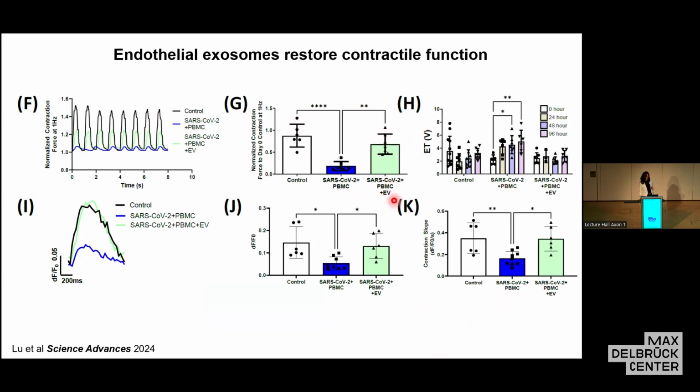And ultimately, this enables us to rescue this cardiac function, at least in the organ-on-chip system, to make sure that these exosome-treated, infected, and immune cell perfused hearts on a chip actually beat quite well, and they continue to fire calcium transients. So this demonstrates how we could use a vascularized heart on a chip to discover a potential biomarker and test a potential biologic therapeutic.